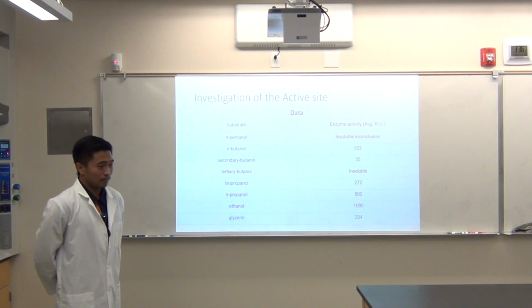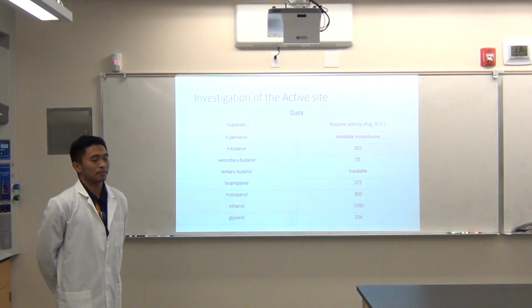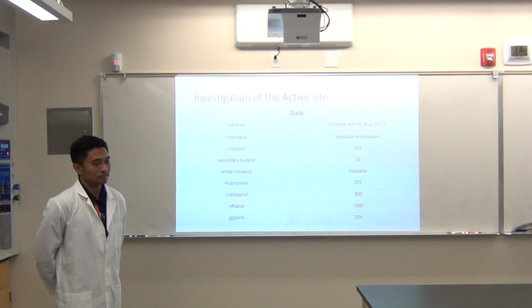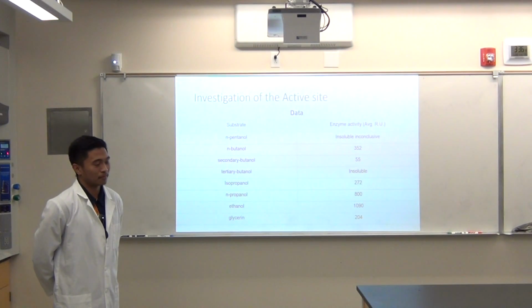change in concentration. One of the downsides to this particular assay is that you're characterizing the activity of ADH not by the disappearance or use of ADH or the formation or disappearance of ethanol. You're using some third molecule to do it. And of course that opens up a debate on whether there is anything else in there that can reduce NAD to NADH. Is that the only source?